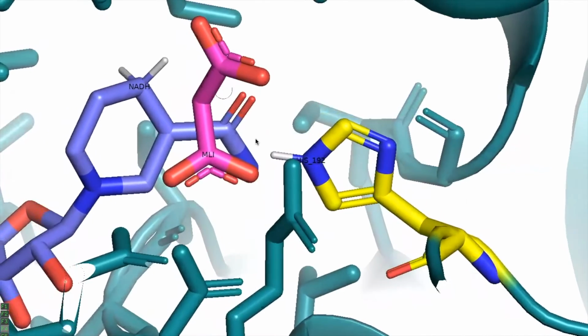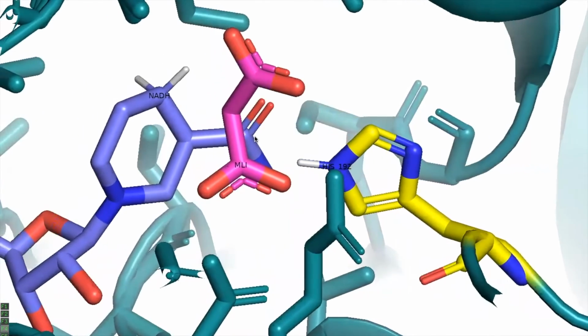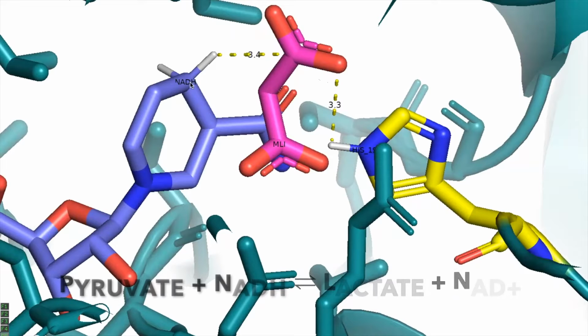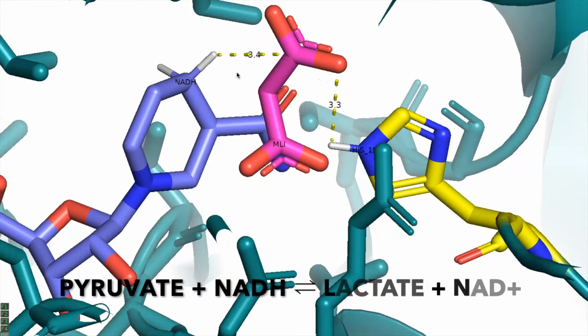If pyruvate was present instead, the reaction would proceed as follows. First, NADH would have to be oxidized into NAD+. So the nitrogen on the ring would push electrons onto the carbon 4 here to regain aromaticity. So the hydrogens from this position on the aromatic ring of NADH would end up leaving and attaching to pyruvate in the C2 position, resulting in a deprotonated lactate molecule.